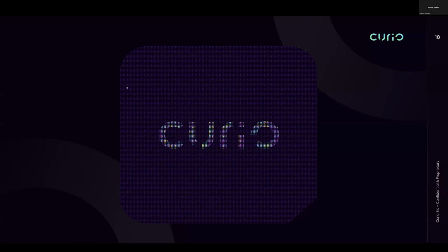Okay. Yeah, my quick question. So it's only for fresh frozen, right? That's what you said, not fixed?